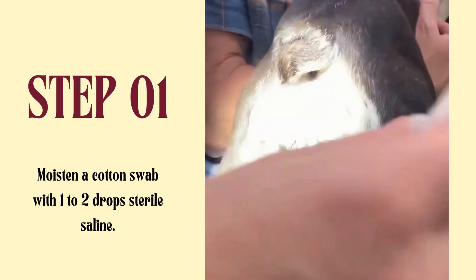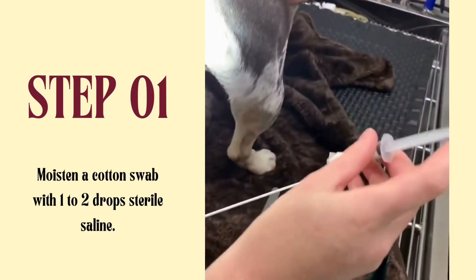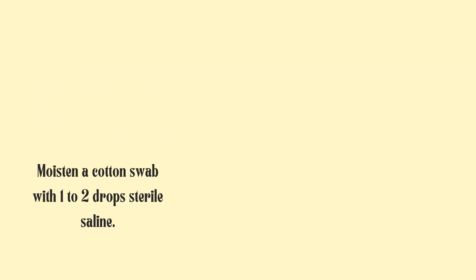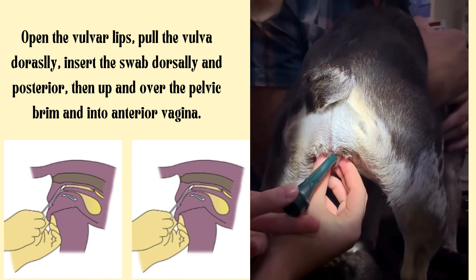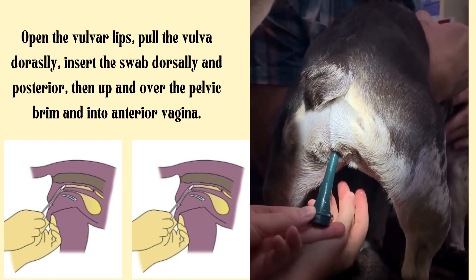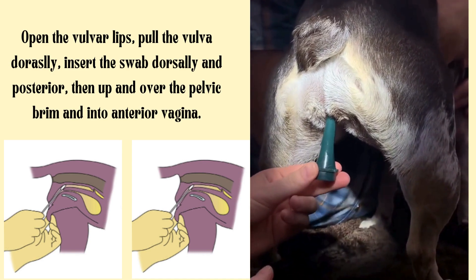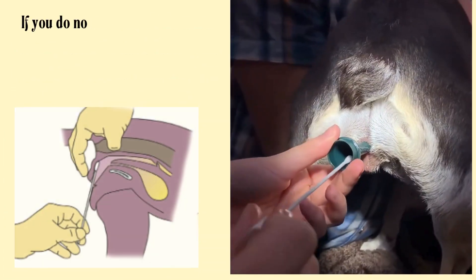Technique of canine vaginal cytology. Step 1: Moisten a cotton swab with 1-2 drops of sterile saline. Open the vulvar lips, pull the vulva dorsally, insert the swab dorsally and posteriorly, then up and over the pelvic brim and into the anterior vagina.